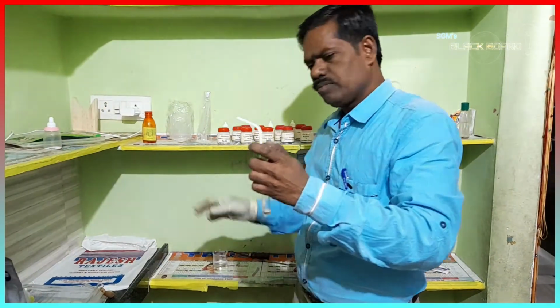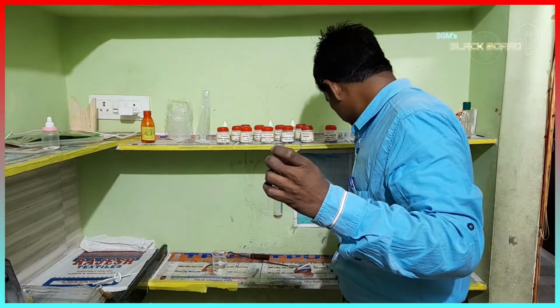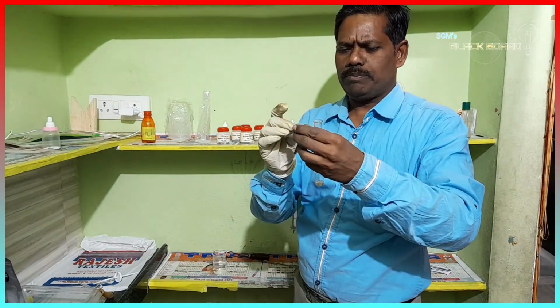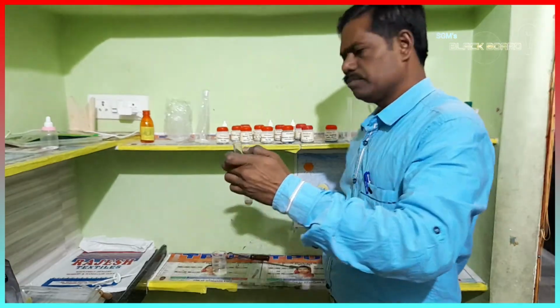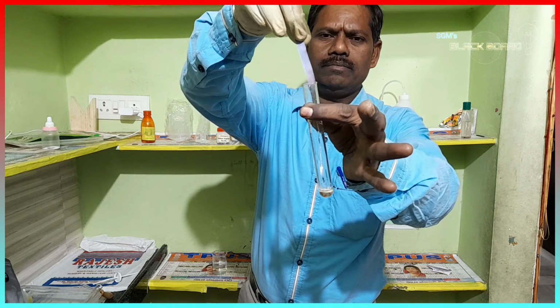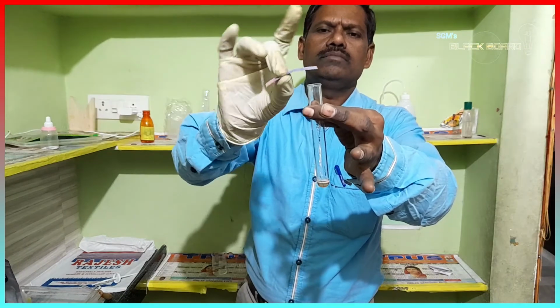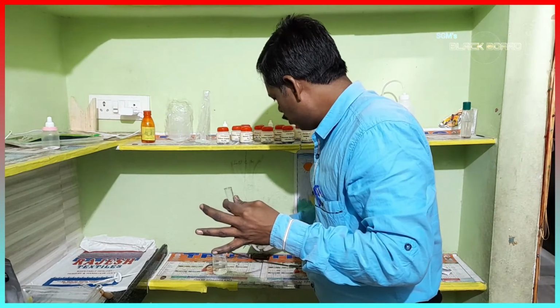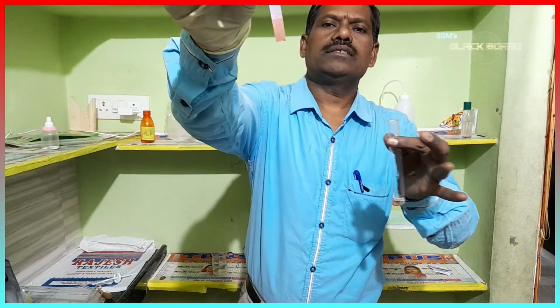When I took a dry litmus paper, there is no change in color here. Once again, I will show you that. Just observe this again. This is wet litmus paper. Dry litmus paper, first I will put it here. When I take a dry litmus paper, there is no change in color. Similarly, when I put it into the water and keep it here again, see, it turned red.